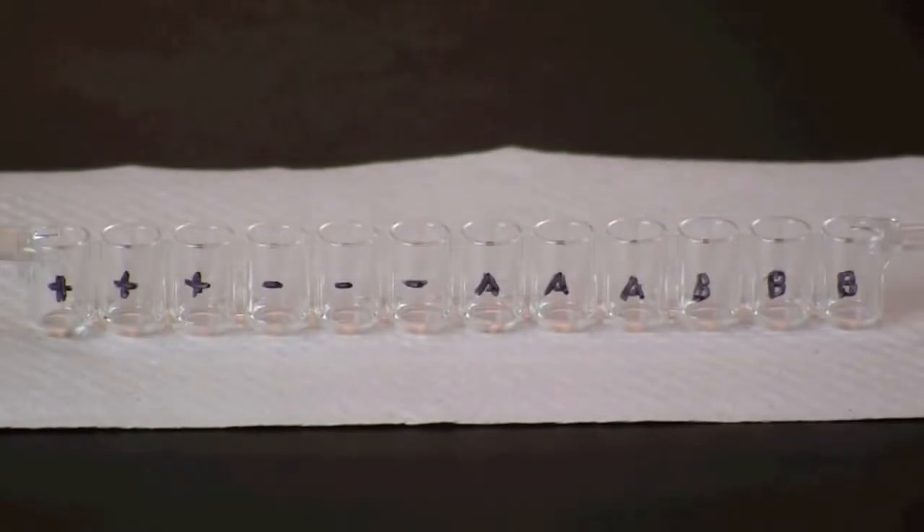Label a 12-well microplate strip. Label the first three wells with a plus for the positive controls and the next three with a minus for the negative controls. Label the remaining wells to identify the serum proteins being tested, three wells for each.